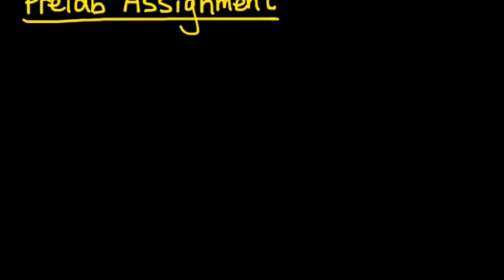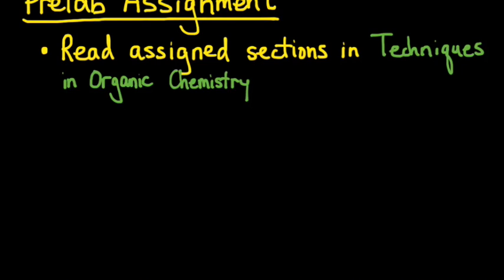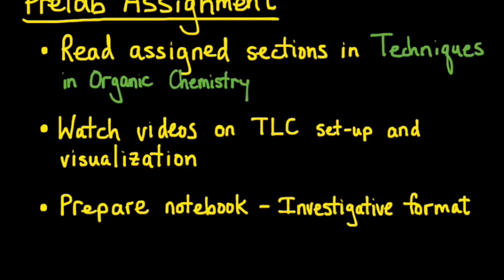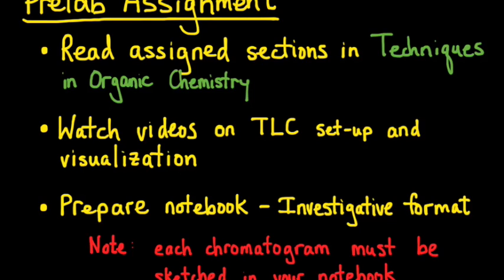The pre-lab assignment for this experiment consists of reading the assigned sections in Techniques in Organic Chemistry, watching the videos on TLC setup and visualization from Morig, and preparing your laboratory notebook in an investigative format. When writing your procedure, be sure to leave enough room so that you can sketch each of your TLC chromatograms into your notebook in an organized manner. So let's discuss the theory of chromatography.